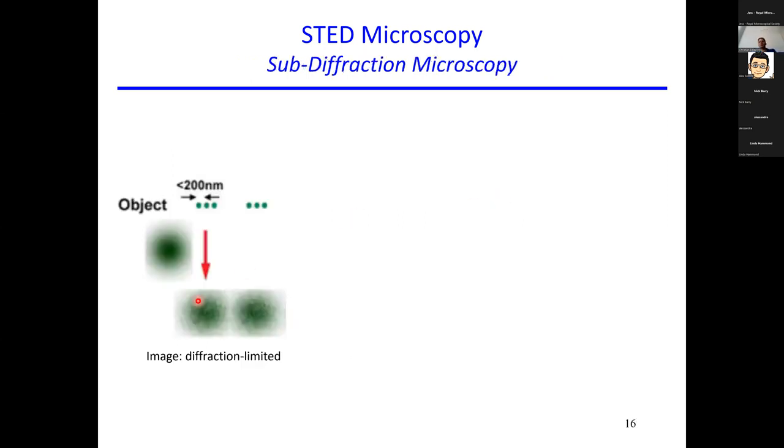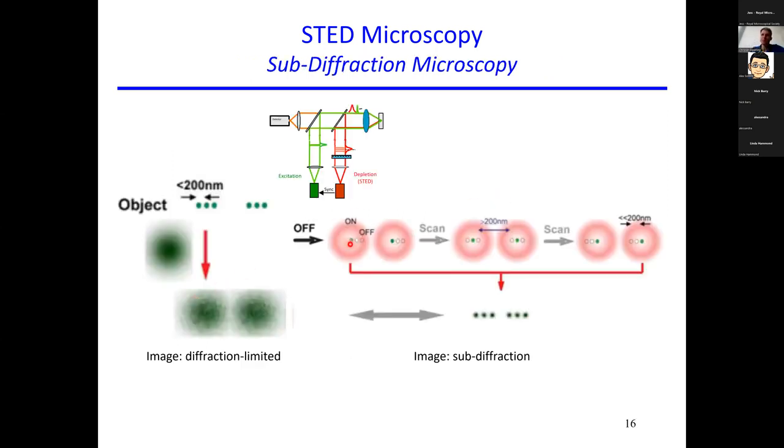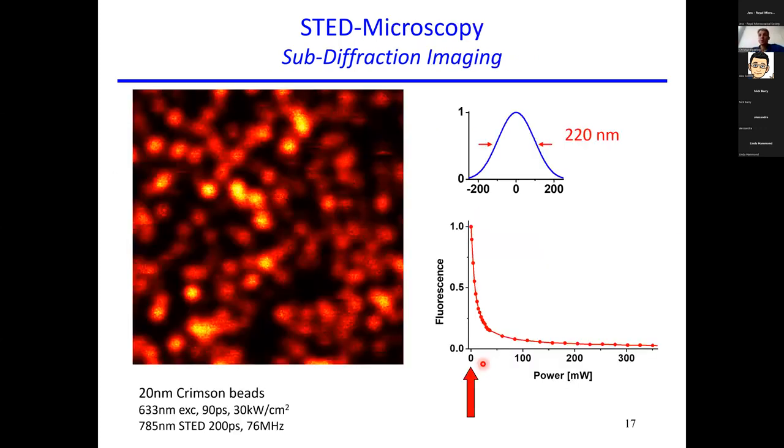This is shown here, for example, and that's the nice thing about STED: we can tune the resolution with the intensity of our STED laser. These are red fluorescent beads, 20 nanometers in size, aligned on the cover glass surface, and we just scan over them. This is the confocal spot, and if we look at the spots, they look blurry. If we make a line profile, they are roughly 200 nanometers in size.